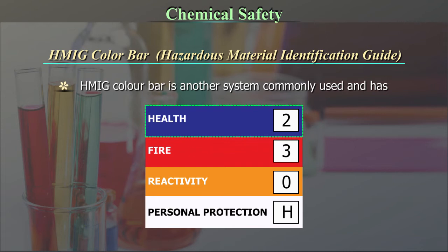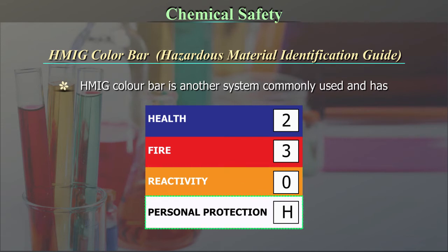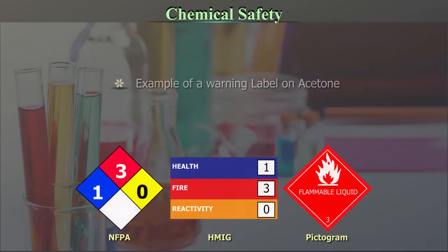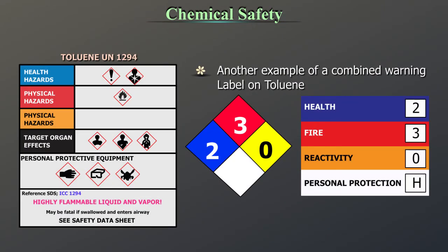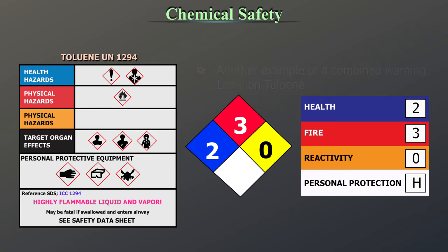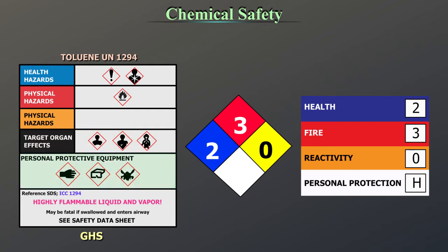HMIG Color Bar — Hazardous Material Identification Guide — is another system commonly used. It has blue for health, red for flammability, orange for physical hazard (i.e., reactivity), and white for personal protection. Fire and reactivity, both components of physical hazards, are separate in this system. An example of a warning label on acetone showing both NFPA and HMIG and pictogram is seen here. Another example is a combined warning label on toluene, where fire is classified as a physical hazard. Target organ effects are also specified and PPEs are illustrated.